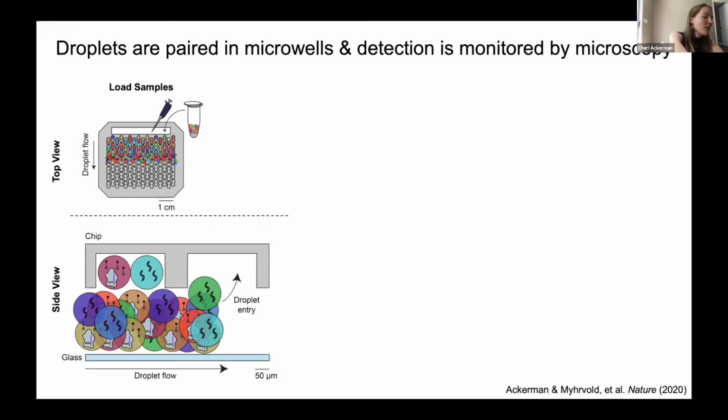And then I also have another one with me. So this is the larger version that we make. It's about the size of a cell phone. And this one has just under 200,000 microwells on it. And each of those microwells is the correct geometry to catch exactly 2 droplets. So 50% of the time, we're gonna get 1 sample droplet and 1 detection mix droplet.